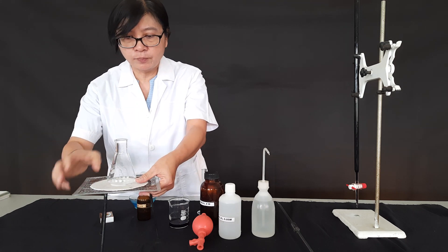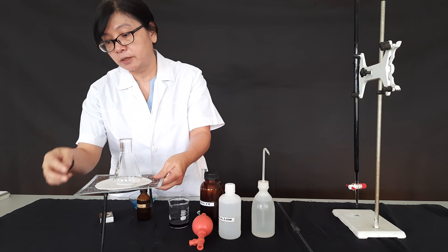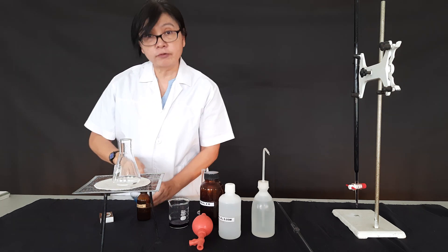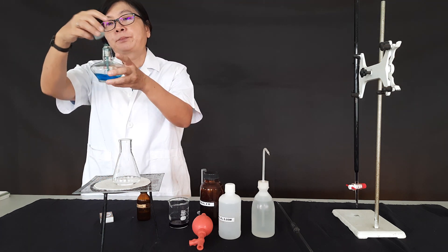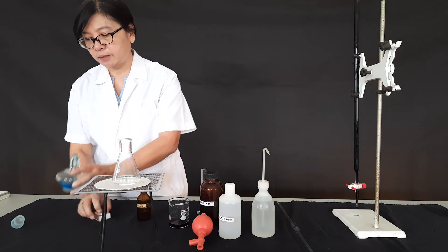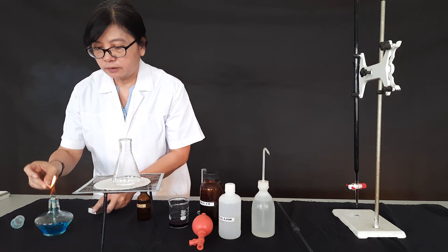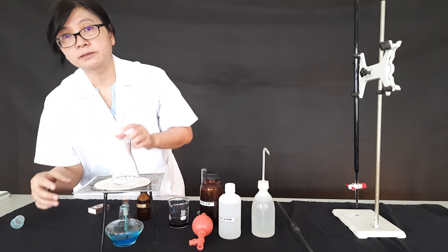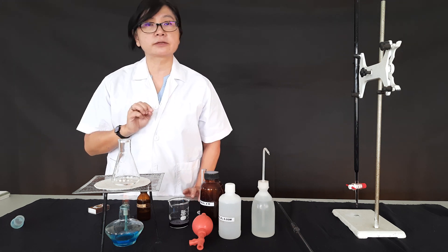We place the conical flask on the tripod here, then we use a spirit lamp underneath. We fill and light it, then wait several minutes until the solution is hot but before it boils.